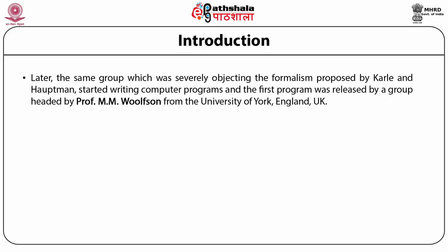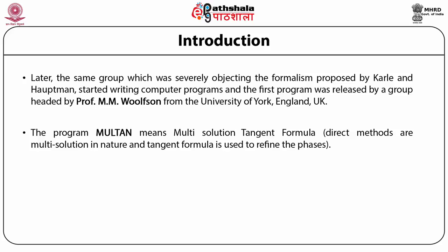Everything they used manually. And the first program was released by the group headed by Professor M.M. Woolfson, and Professor Germain also took an active part in that. These are the professors from the University of York, England. The program name was MULTAN. In the program name MULTAN, M-U-L, MUL means multi-solution tangent formula.